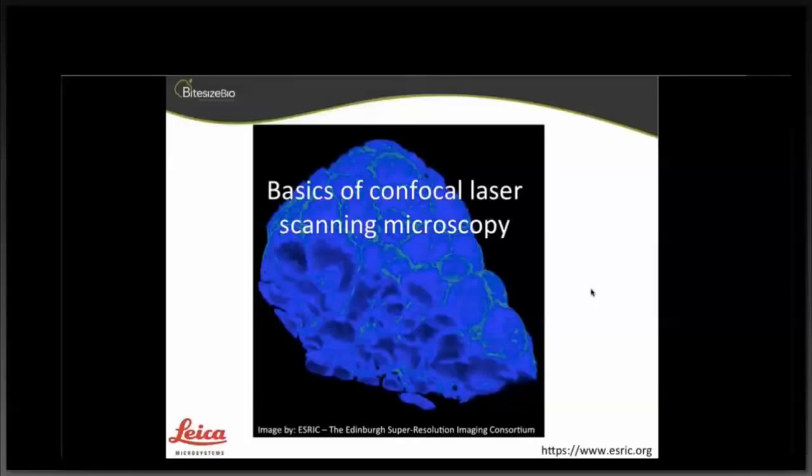Can confocal scanning microscopy be used for quantification purposes, to say, look at the differences in the expression of proteins? Yeah, I mean, it can do. I think it's possible to do, but you just need to be wary that your different cells are going to have different expression. And quantifying intensity is possible as long as you try and keep your settings all the same. There are options with certain detectors, like single photon counting or photon counting, which is more quantitative than just calculating intensity. So it is something that's possible, it's just something to do carefully.